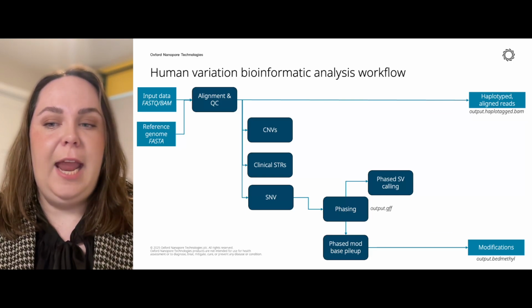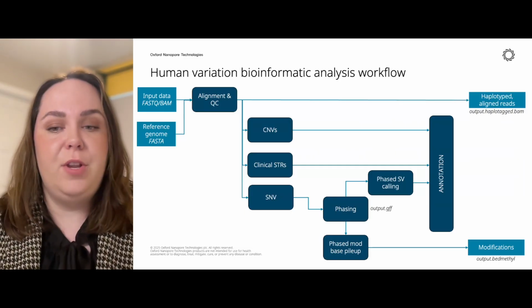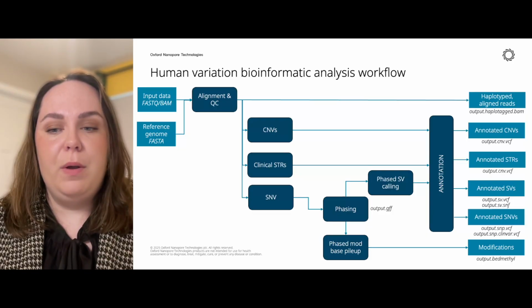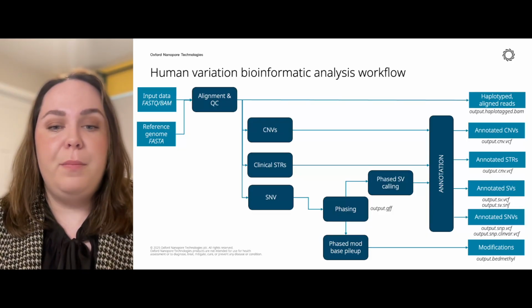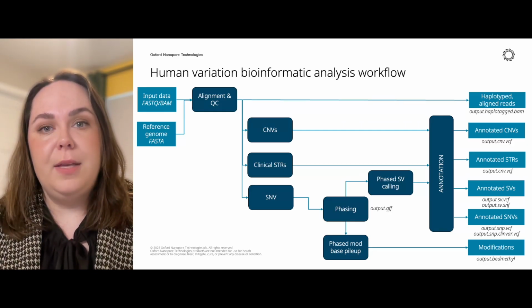These variants are then annotated according to the known genomic features for the standard human genomes. This is a key step as it streamlines the interpretation of nanopore sequencing data by linking variants directly to human-readable genome features. This is reflected in the variant reports. One report is output per workflow module, along with the functional bioinformatic outputs, including BED files, VCF files, and alignment files.